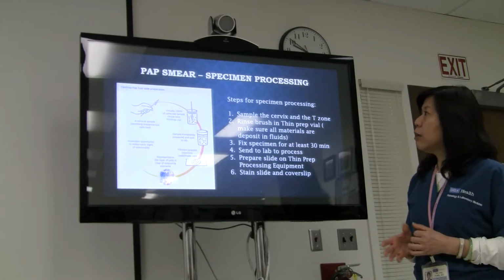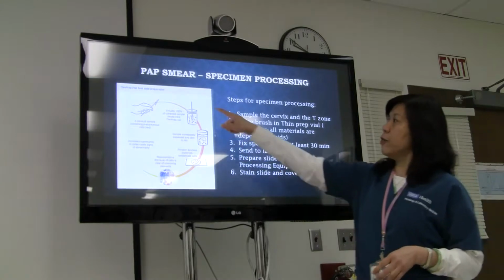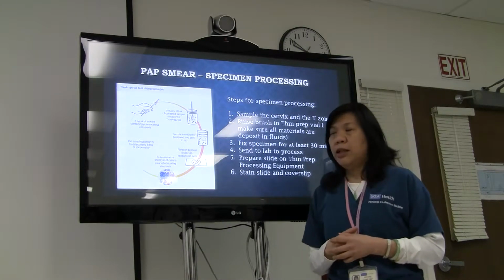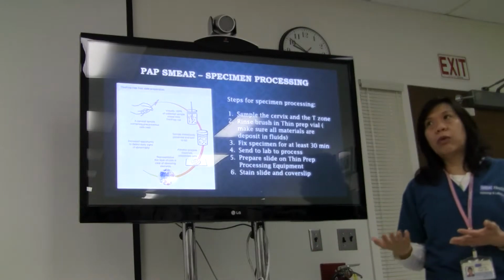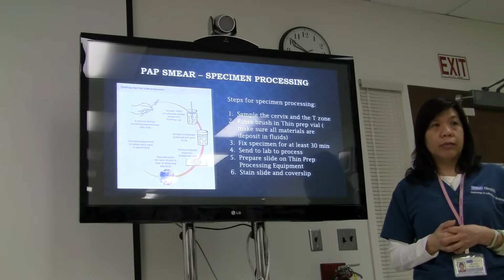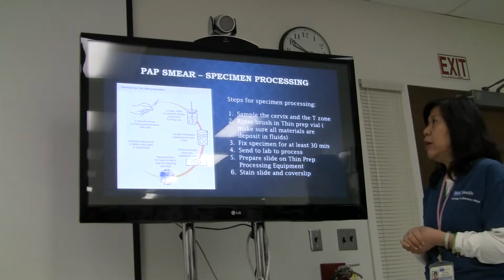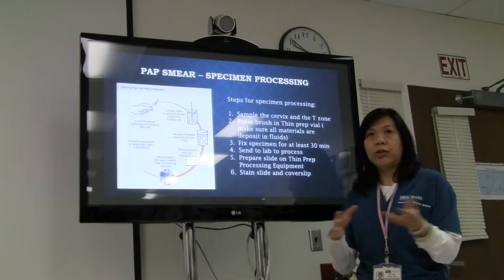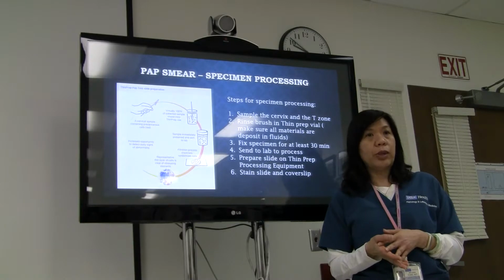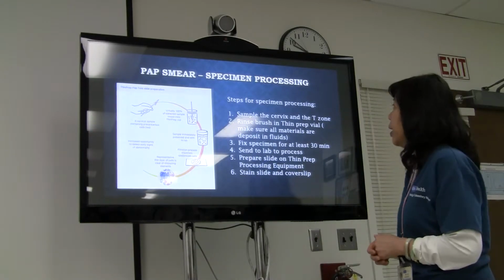Okay, so there are several steps of specimen processing. After they deposit the cell material into the vial, it could be sitting there for up to a few days or up to 3 months without hurting the cells. They preserve the cell morphology, so it does not have to be sent to the lab immediately. It could wait. If you wanted to deliver once a week, it could wait for a week and you just collect all the specimens.